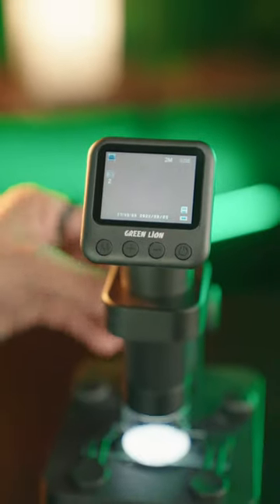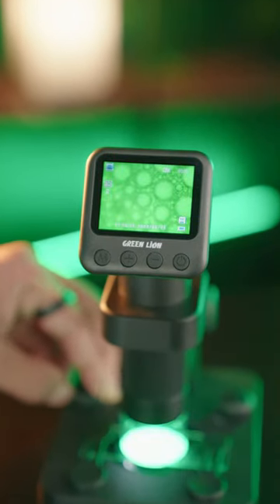This product provides you with a great experience of a portable microscope. Contact us to place an order.